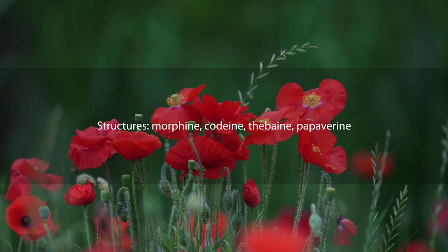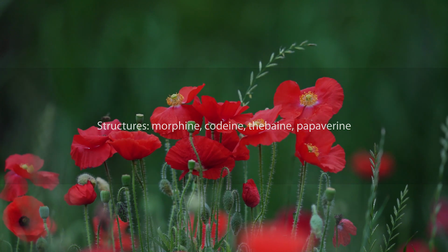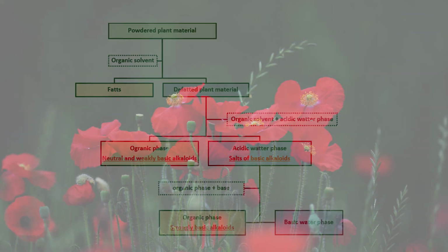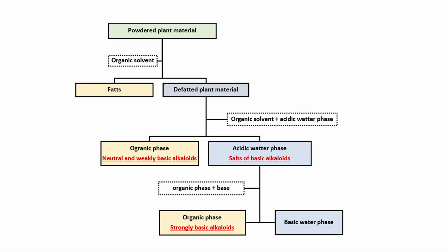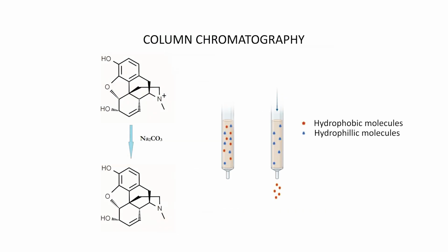These include, for example, morphine, which is a powerful analgesic agent, cough-suppressing codeine, and papaverine, which acts against smooth muscle spasms. This laboratory exercise presents the model isolation and identification of alkaloids from heterogeneous plant material. Pure fractions of alkaloids are obtained by the shown multi-stage extraction. A simplified procedure with one-stage extraction will suffice to perform this exercise.